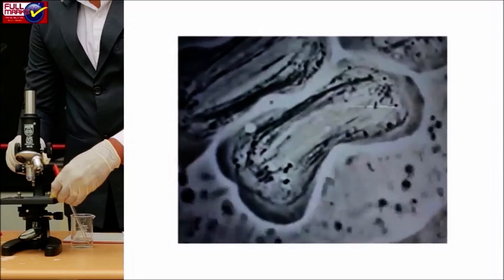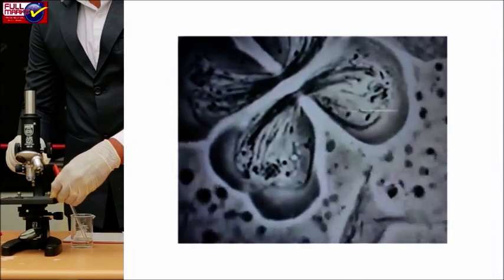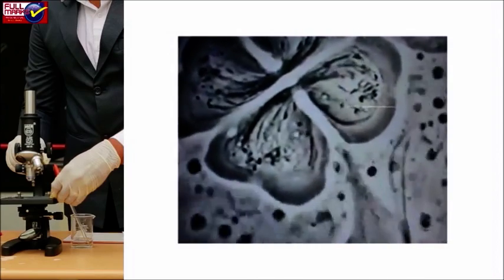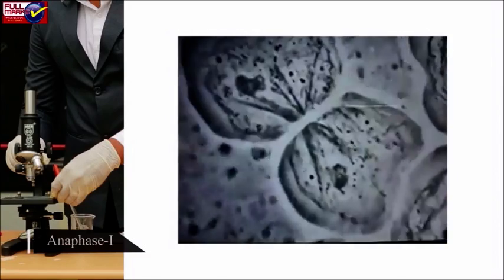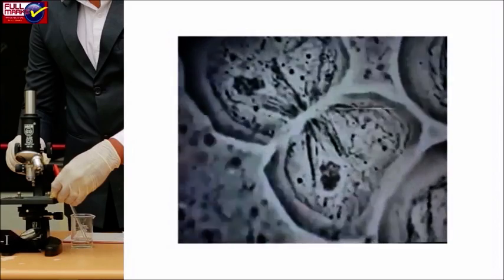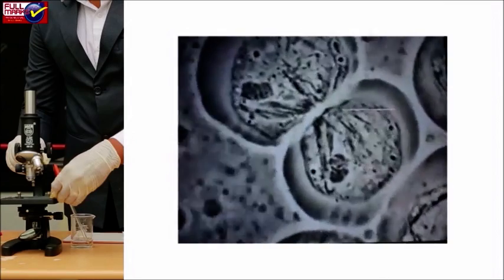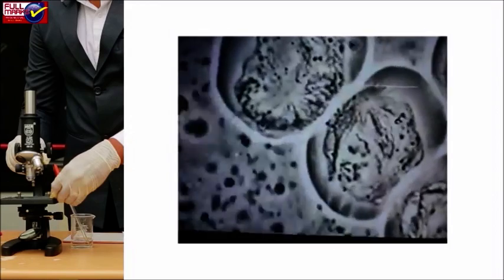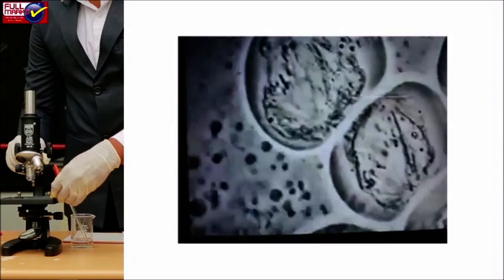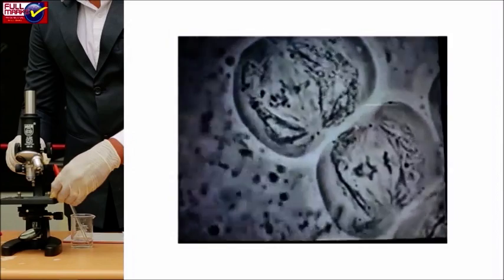Anaphase I: It is characterized by the separation of whole chromosomes of each homologous pair, that is tetrad, so that each pole of the dividing cell receives either a paternal or maternal longitudinally double chromosome of each tetrad. This ensures a change in chromosome number from diploid to monoploid or haploid in the resultant reorganized daughter nuclei.